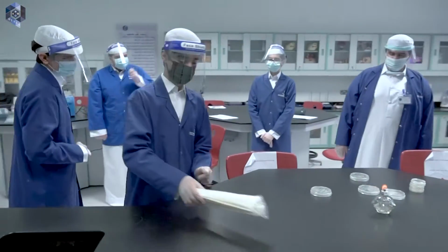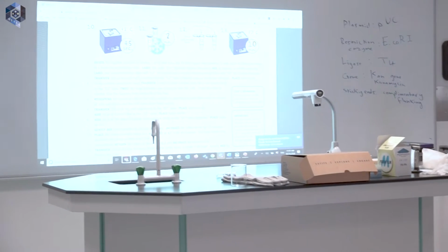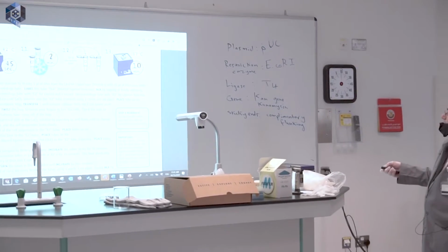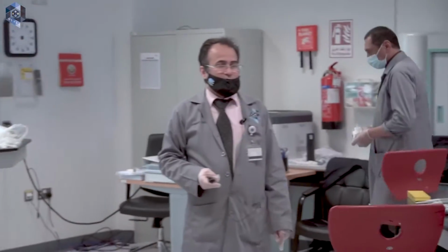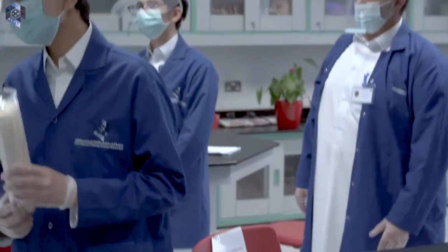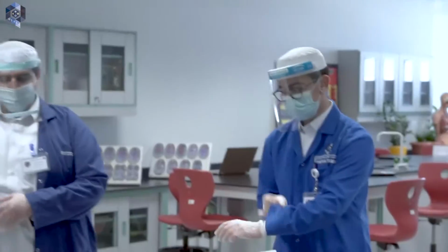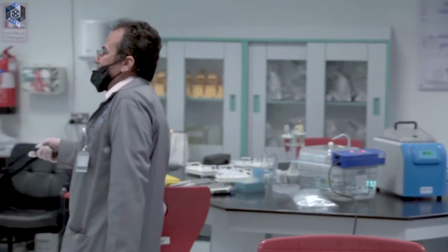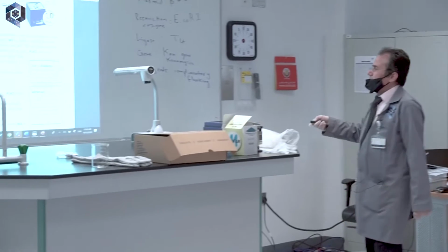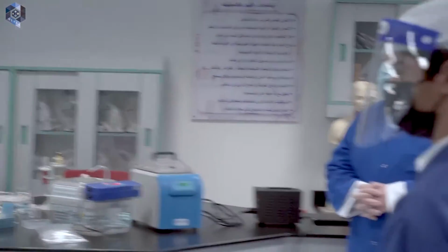Okay. Now we will do what? Transfer 500 microliters of this, which we did. Place tubes on ice, which we did. Now, using a sterile inoculating loop. One of you, show me the sterile inoculating loop. Yes, these are the sterile inoculating loops. You will use them to transfer 5 well isolated colonies from the source plate to the test tubes we have just prepared with the calcium chloride and the recombinant plasmid. Okay, and then twist them.